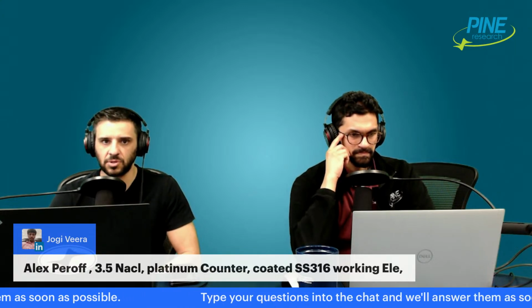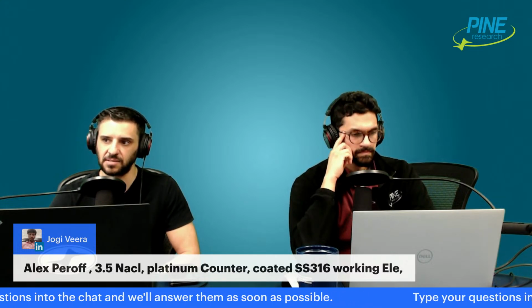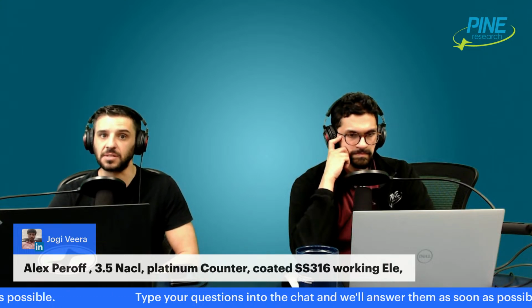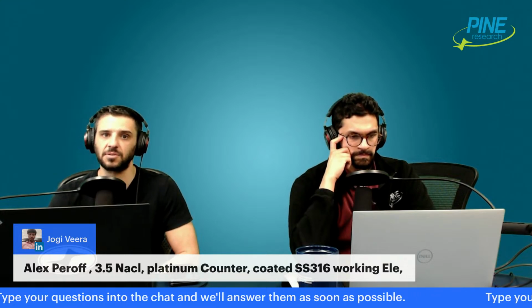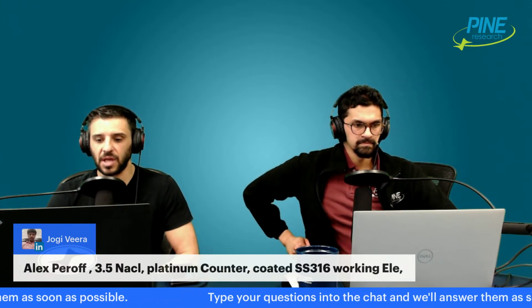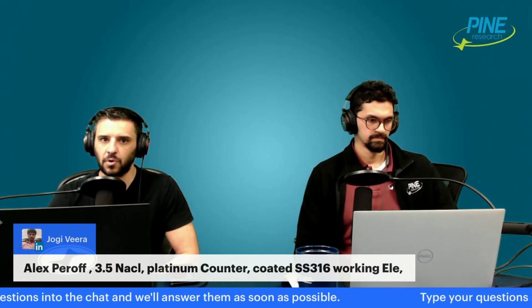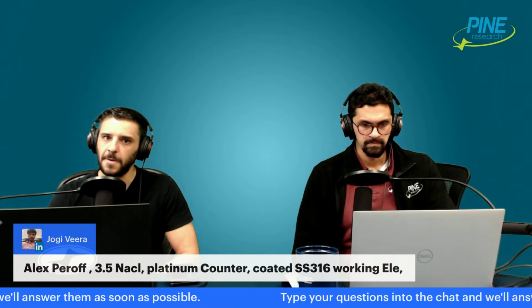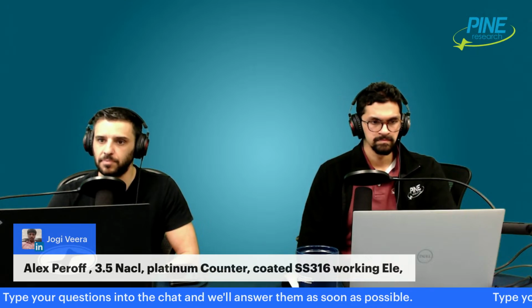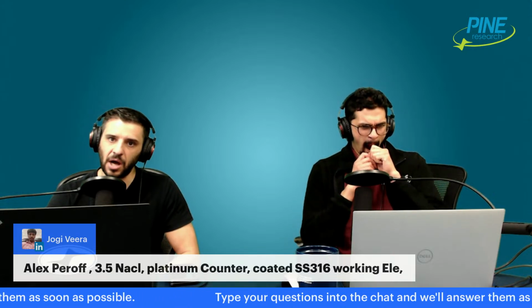So part of the difficulty of your test, and probably in general, is that you are up against a system and a working electrode that has a very high polarization resistance. It's by design, right? 316 stainless steel is tremendously resistant to corrosion. That's why it's called stainless steel. So that could be part of it, obtaining the parameters. And the passivation layers that form on stainless steel happen pretty quickly with slight polarization. So there's also that added wrinkle as you start scanning away from open circuit potential, it's tricky. You're making Tafel plots, and how accurate are they?